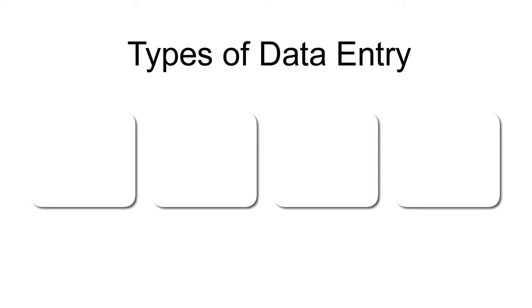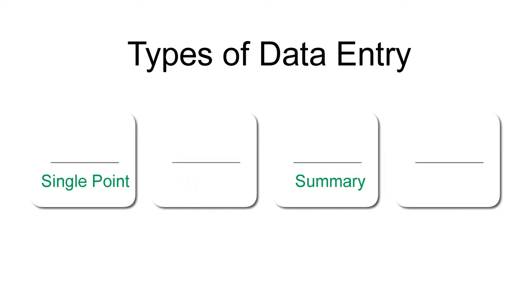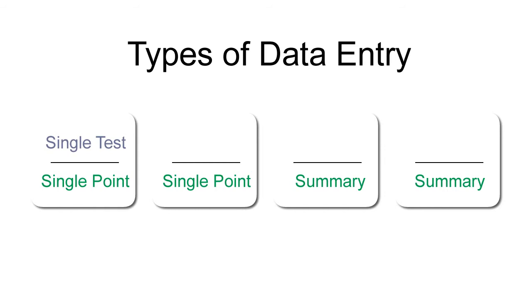There are four types of data entry. As we learned, you can enter single point or summary data. Our first type of data entry allows you to enter single point data for a single test. Or you can enter summary data for a single test.